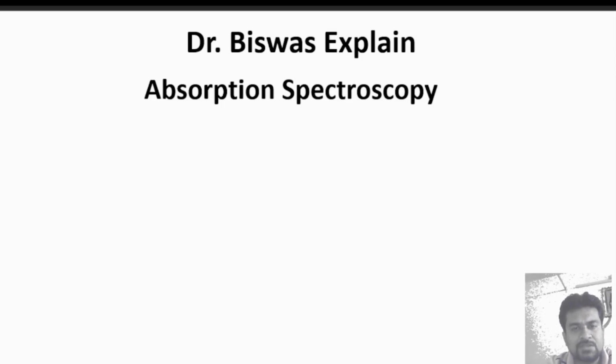If they are in nanoscience and material science, they need to synthesize some nanomaterial, and the first signature of whether your sample is prepared or not is very elegantly measured by absorption spectroscopy.